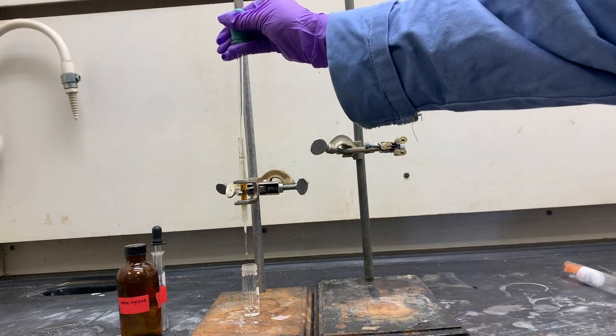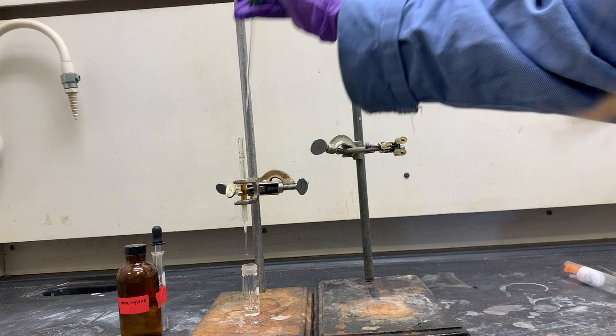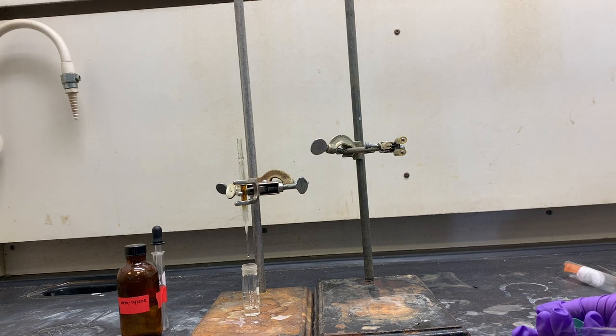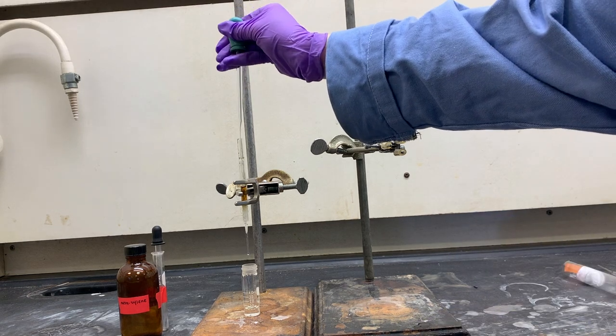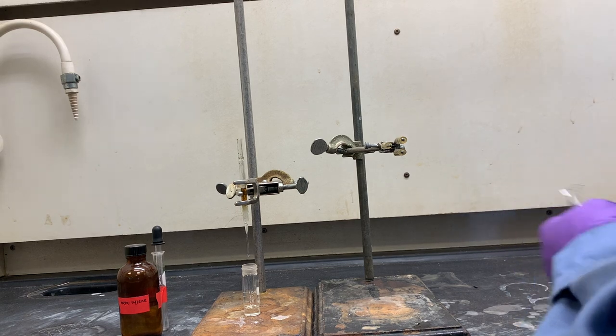This will simplify extraction. Use air pressure from a pipette bulb to force all of the liquid through the pipette into the conical vial. Use a small amount of m-Xylene to rinse the filtration apparatus and collect as much product as possible. This filtered liquid should be fairly clear and colorless.